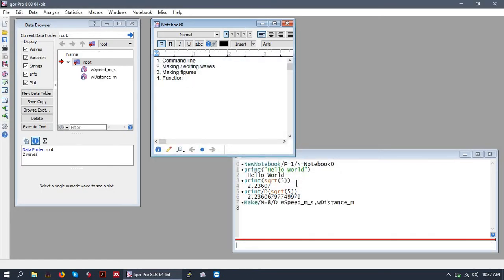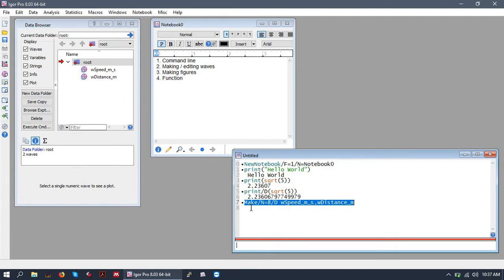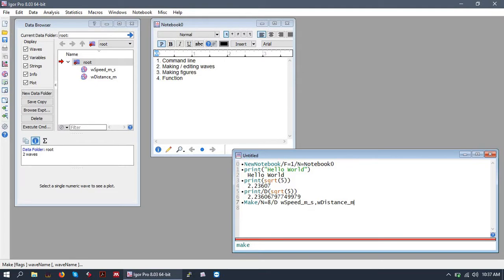Before we edit those waves, just take a note in the command prompt, Igor has showed us what command it used to generate those waves. So in the future, you can simply type make and give some flags and make your own wave this way.